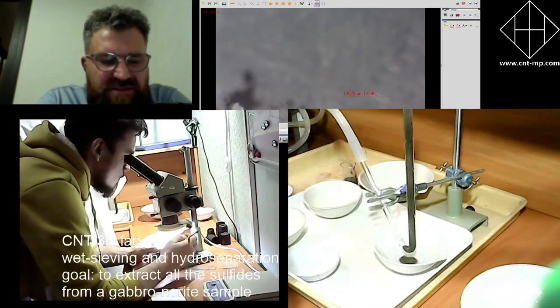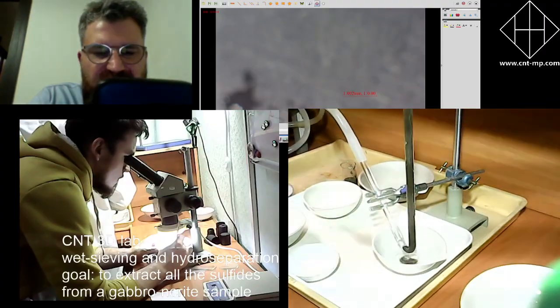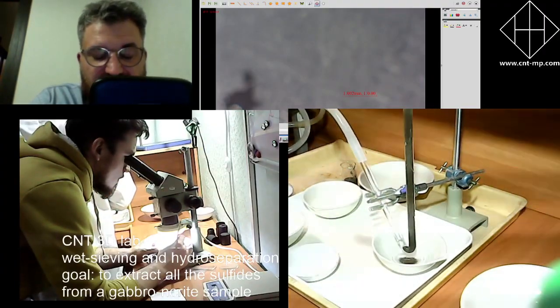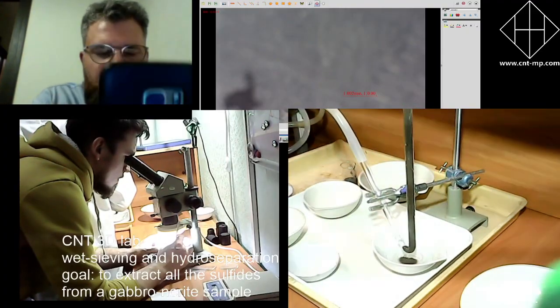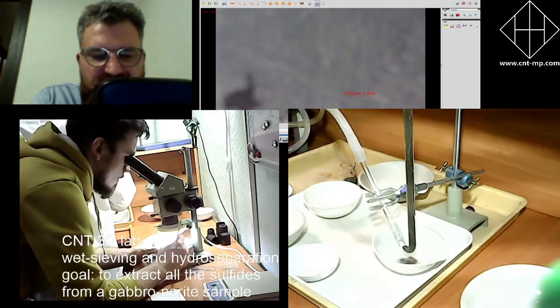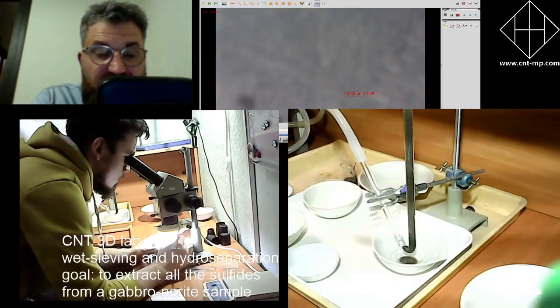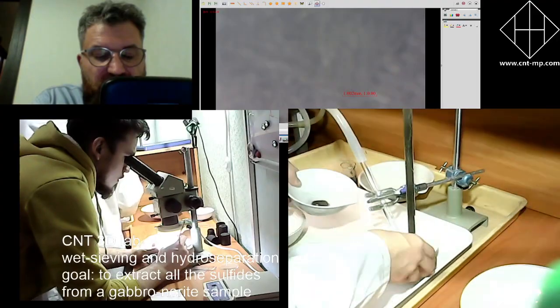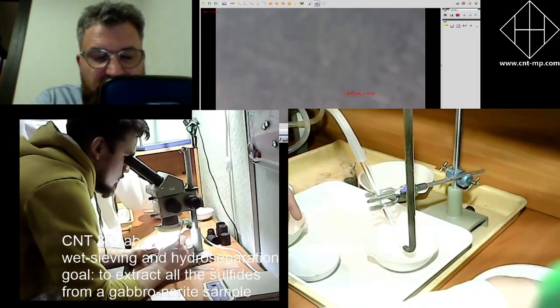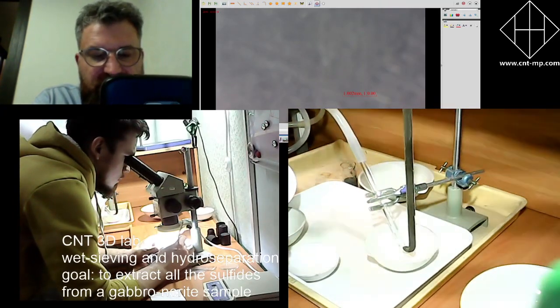Whenever we've extracted the certain amount of grains that we needed for other types of in situ or grain analysis, whatever we need from the concentrate, the residue is tailings, and these tailings can be analyzed whichever method you want to use, whether it's assay, wet chemistry, anything, it's enough material for that, or X-ray diffraction, or X-ray fluorescence, but X-ray diffraction is popular in this case.